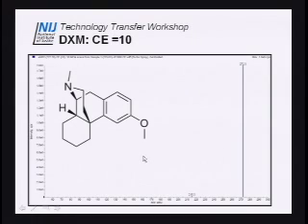So the reason why I chose dextromethorphan is once I was creating a presentation, and my boss's boss's boss, the director of the laboratory, was looking at it, and he goes, "Oh, this says the transition for dextromethorphan is 272 to 128. I don't see any 128 here in your product ion mass spec. It must be wrong." And so, being confident, I went, "No, that's not wrong." So I went upstairs and checked, and I knew that I was right because I often think that I am.